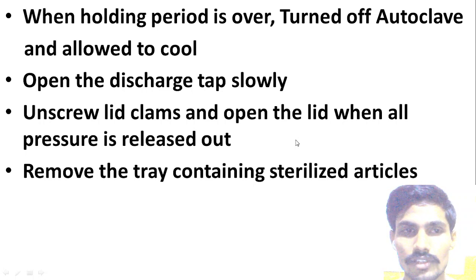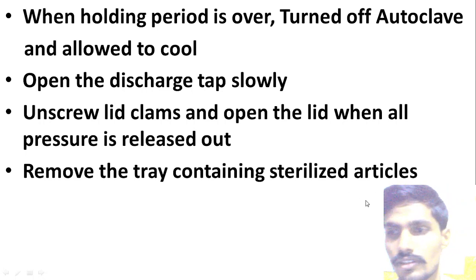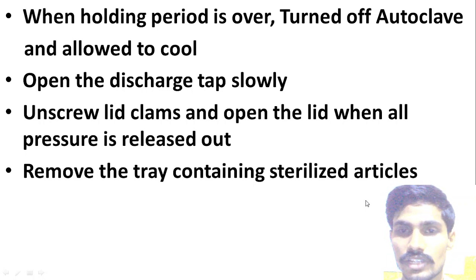Okay. And after removing the lid, what can you do? Remove the tray containing the sterilized articles. The articles which we have kept in the autoclave, we have to remove. Those are sterilized articles. Those articles we have to use in your hospitals.